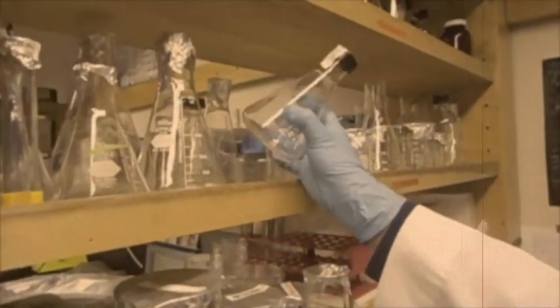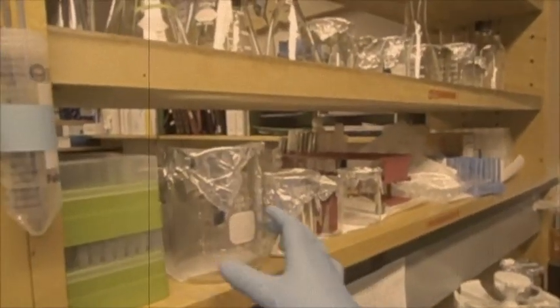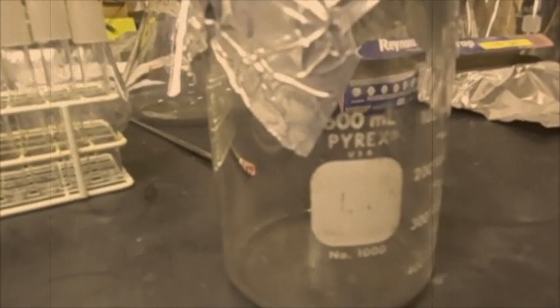To make your own LB agar plates, use a beaker of any size or shape as long as it's heat proof and has more than enough space. We will use this 600 ml beaker to hold 250 ml of our solution.